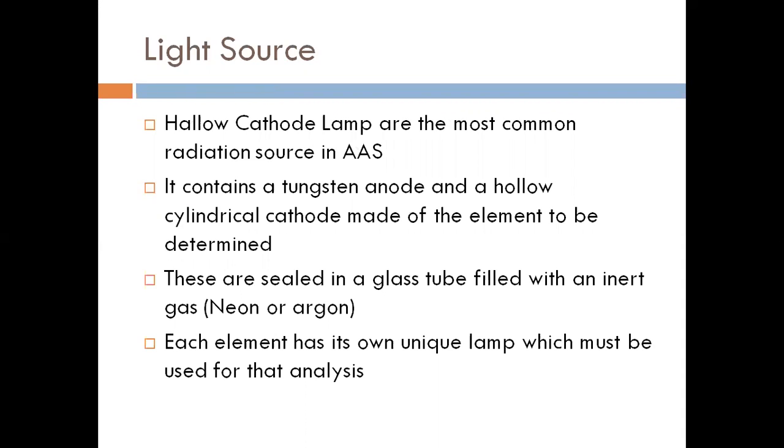sources of continuous emission were used. This means that light in the visible and adjacent UV range was used. This showed the necessity of a spectrometer with 0.002 nanometer resolution when using this source, which was impossible with equivalent equipment available at that time.